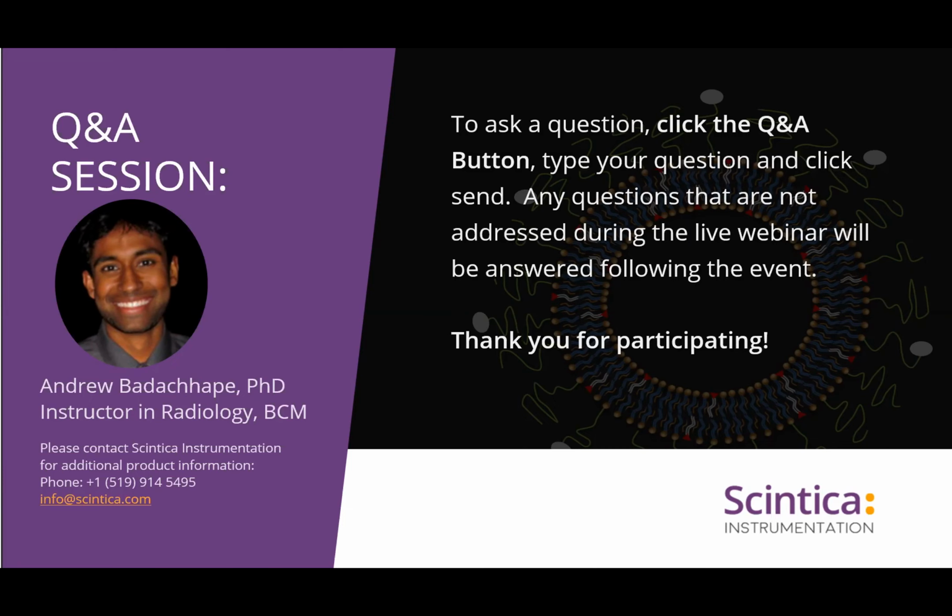There are some intracellular applications as well, but for the ones that I've mostly been talking about, this is mostly extracellular.